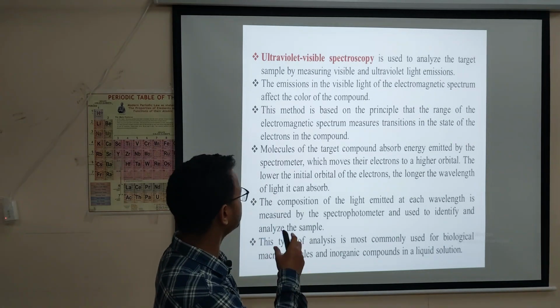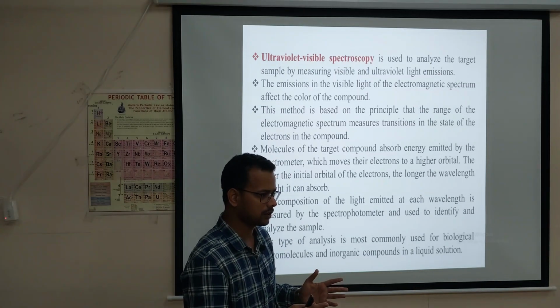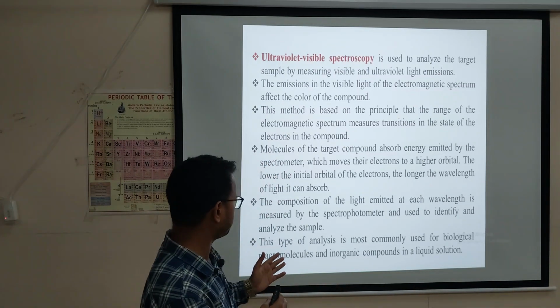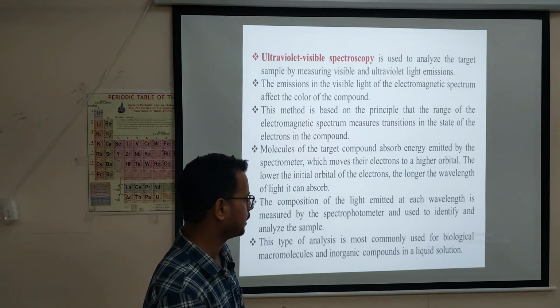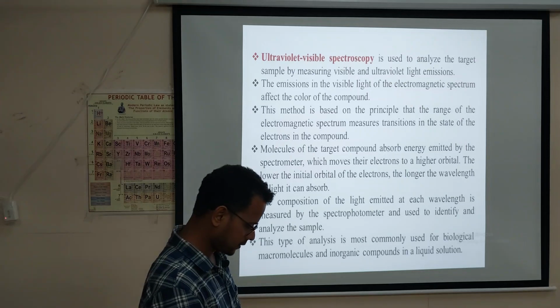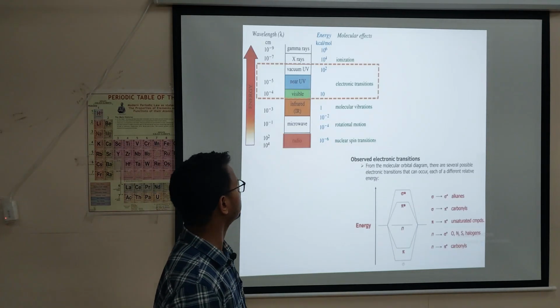This type of UV-visible spectroscopy has a wide range of applications. Basically, this type of analysis is most commonly used for biological macromolecules and inorganic compounds in a liquid solution, right. Now, we will move to the next slide. This is a very fundamental slide.